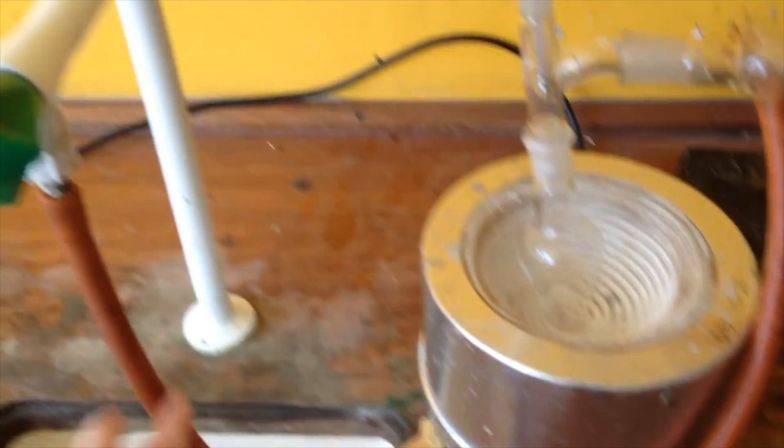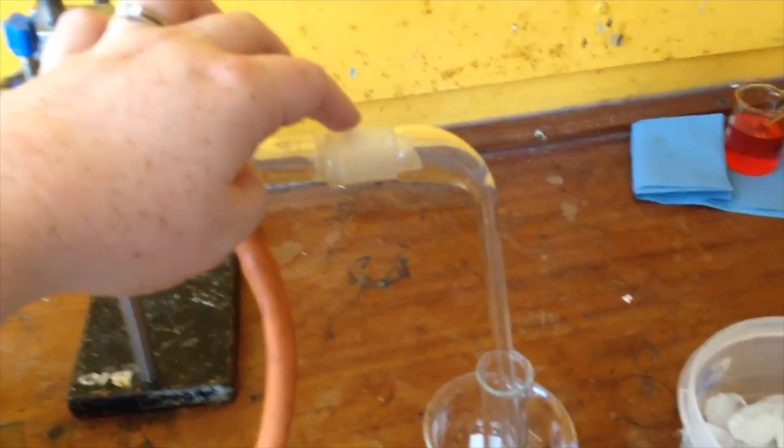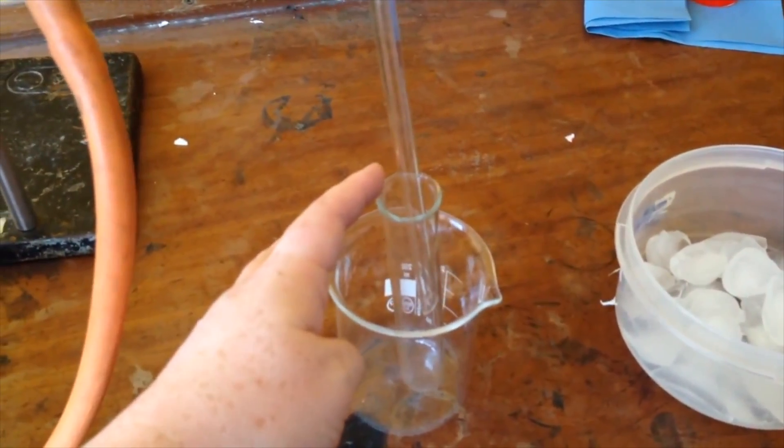This is the condenser. You need this end here attached to the tap and then the other end has to go into the rather dirty sink. Then this end here we have the delivery tube into our boiling tube which is going to be our water bath at the end.